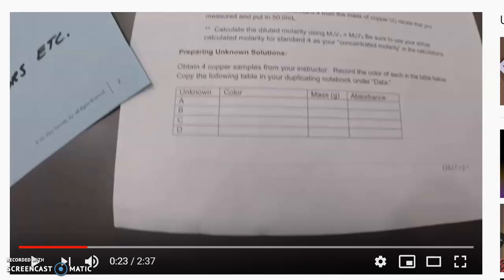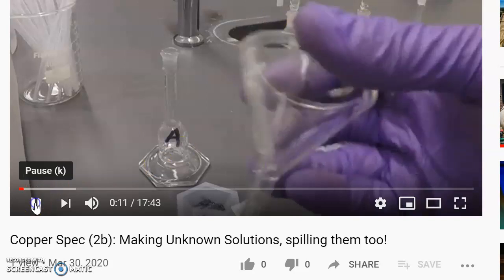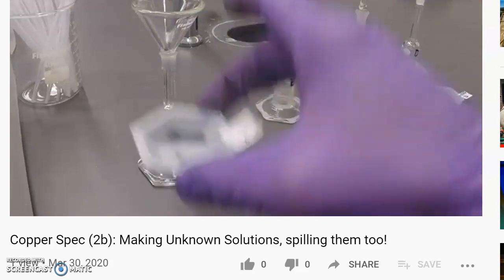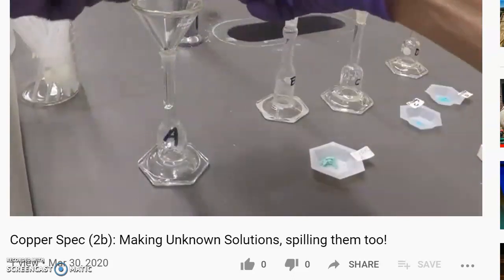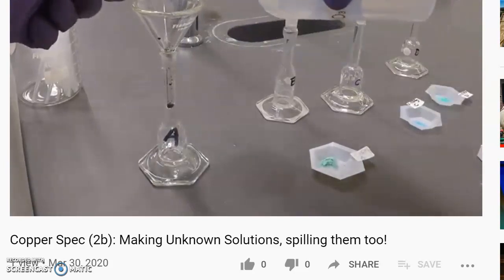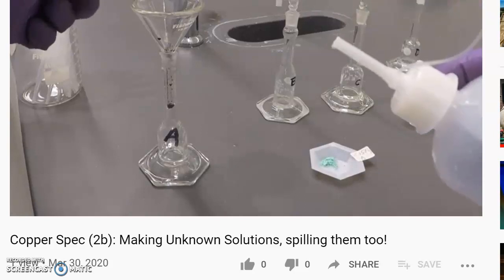And I want to show you this one next. So here we are making our samples. We're going to do an analytical transfer. That means all of the material that is in that weigh boat is going to go into the flask. Dissolving these up with nitric acid.